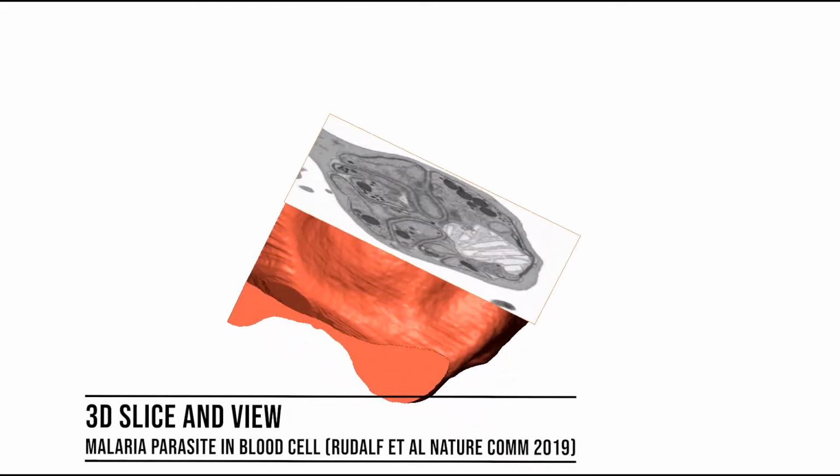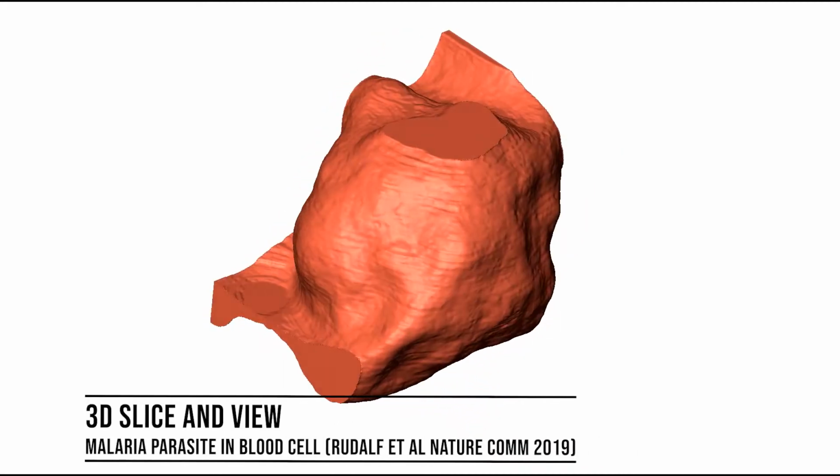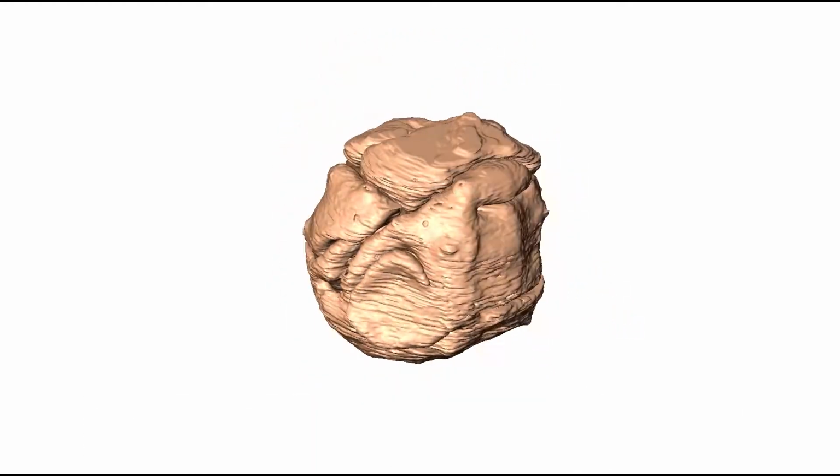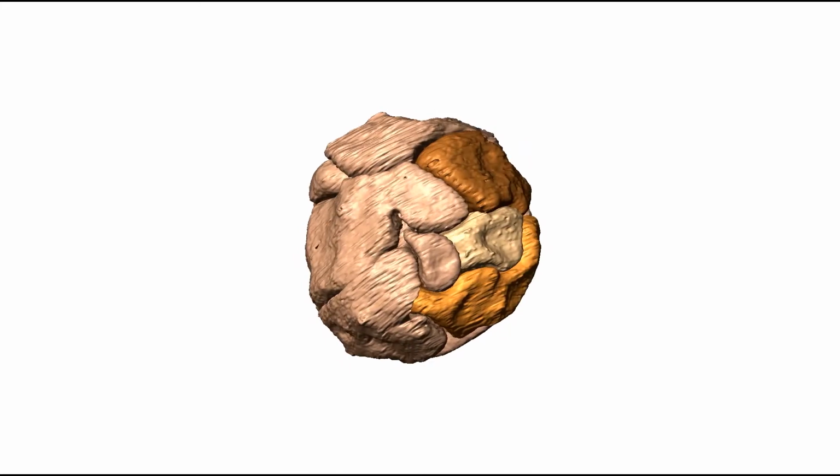A cool extension of cross-sectioning is the technique of FIB tomography, which uses successive cross-sectioned images to produce 3D renderings of hard and soft materials.